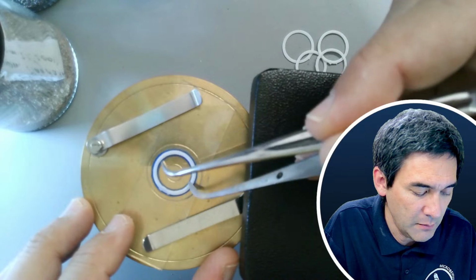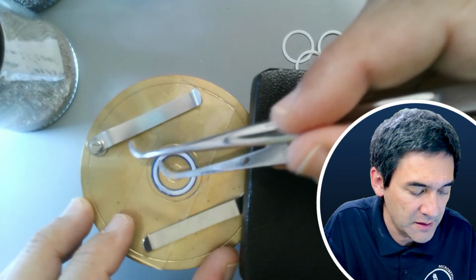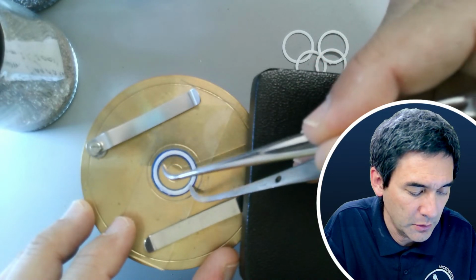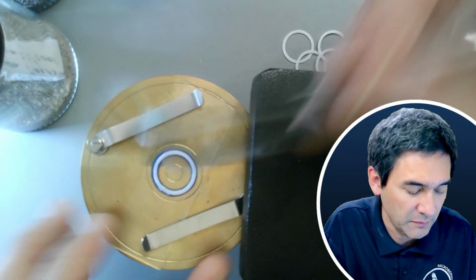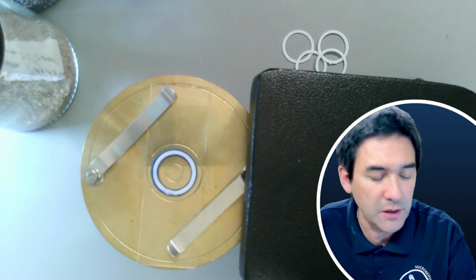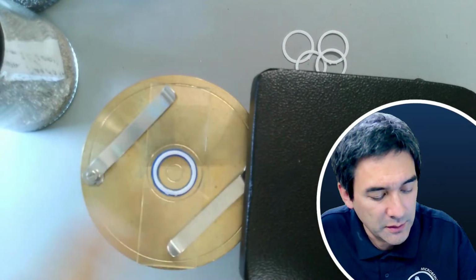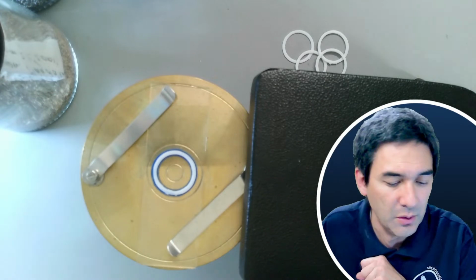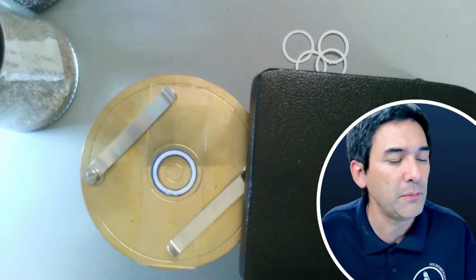Again, the reason why I'm using the blue nail polish is because it's easier to see, but as you know, it's a question of taste really. If you want to use clear nail polish because you don't like to see the ring, then of course, whatever you like. I'm going to leave it on here right now, because I'll be adding another layer around it later so that I'm able to glue on the cover glass.